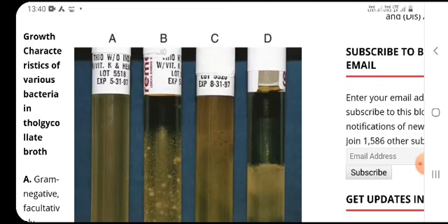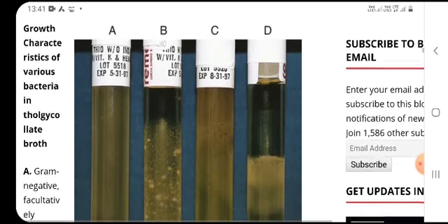This medium is also useful for the culturing of blood samples wherever anaerobic organisms are required to be isolated. So for diagnosis purpose, for the diagnosis of infections by anaerobic bacteria in humans, this medium is used. And another use that we have seen is in the cultivation of anaerobes, detection of anaerobes in order to check the sterility of a particular product.